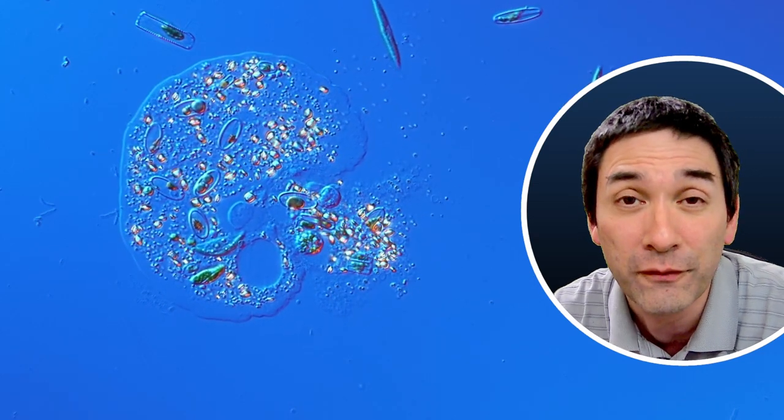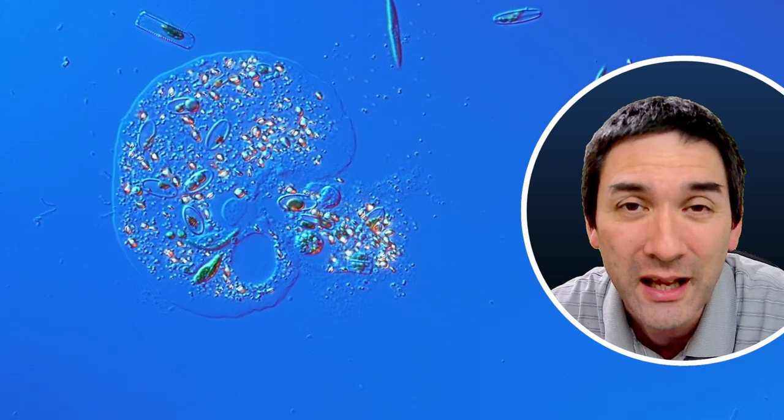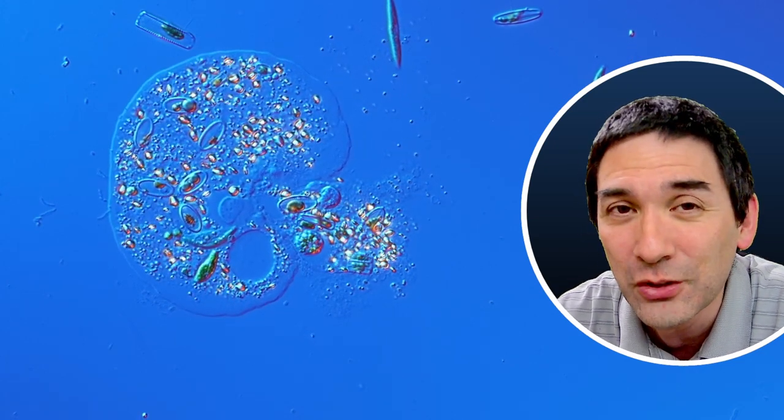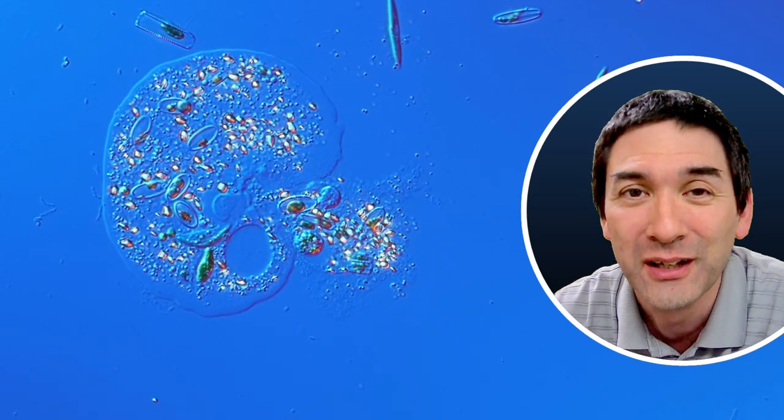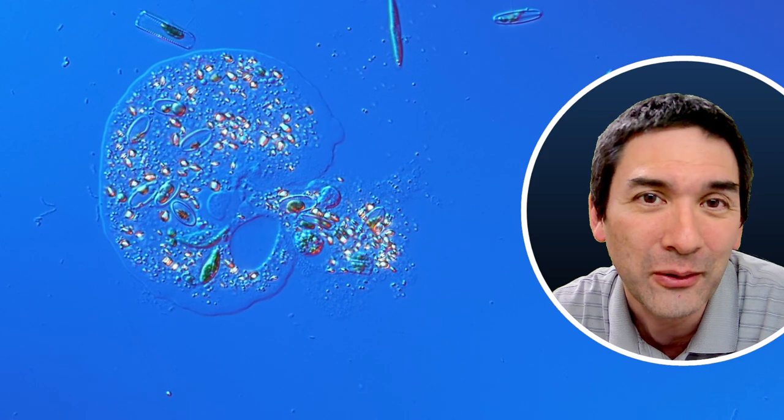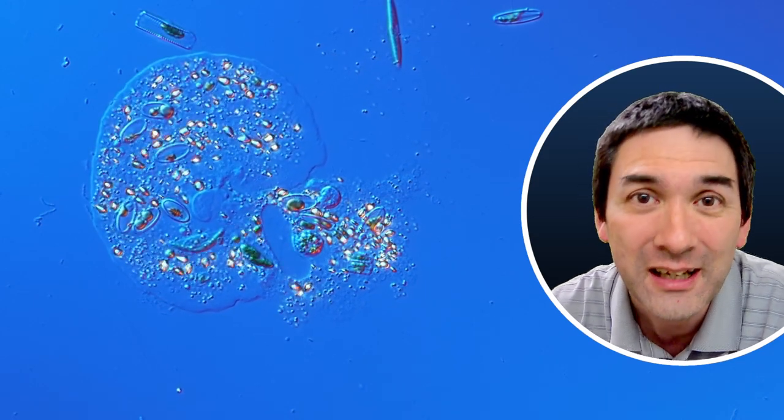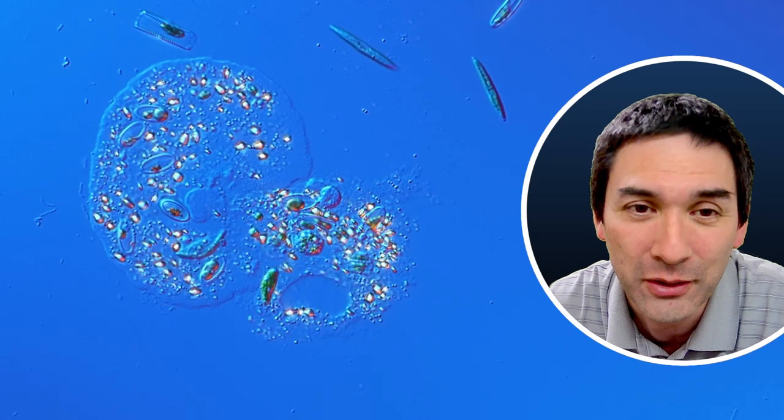This is of course now a food source for other microorganisms. And I think one of the interesting things here is that you're actually able to see what the amoeba has eaten because the green structures that you see now in there, these are diatoms, which are algae, that the amoeba has eaten. And now here we go again.